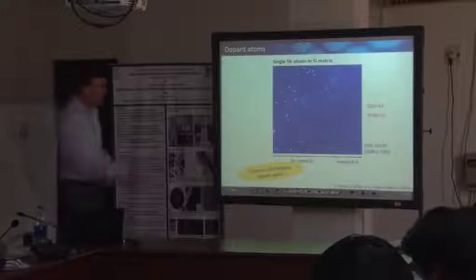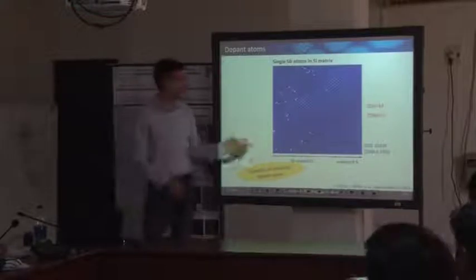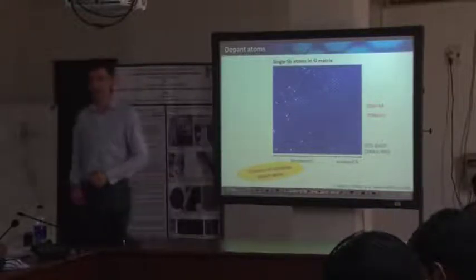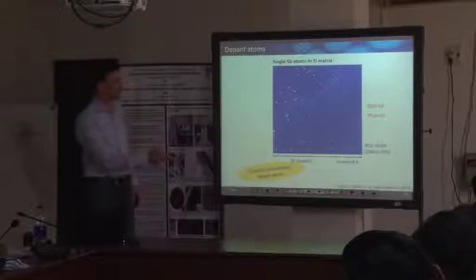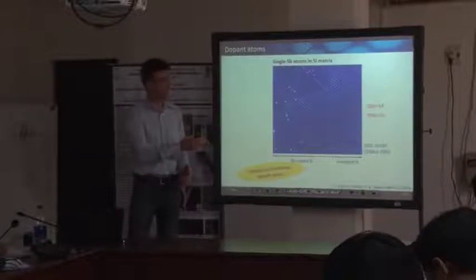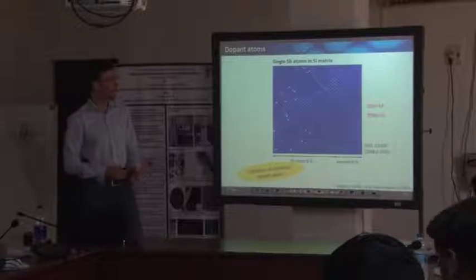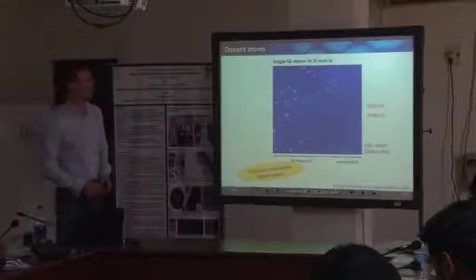So in principle you always know where your atomic column is. This is also a very early example from 2002, where people demonstrated the distribution of doping atoms in a silicon wafer. This is one of the early examples where people dealt with point defects, in this particular case done by ion implantation. This is a pretty heavy element, as before, and to visualize the distribution of heavy elements is easier. Nowadays, people even deal with light elements or vacancies, like point defects in such lattices. But this is just a very early example of what you can do with atomic resolution STEM.